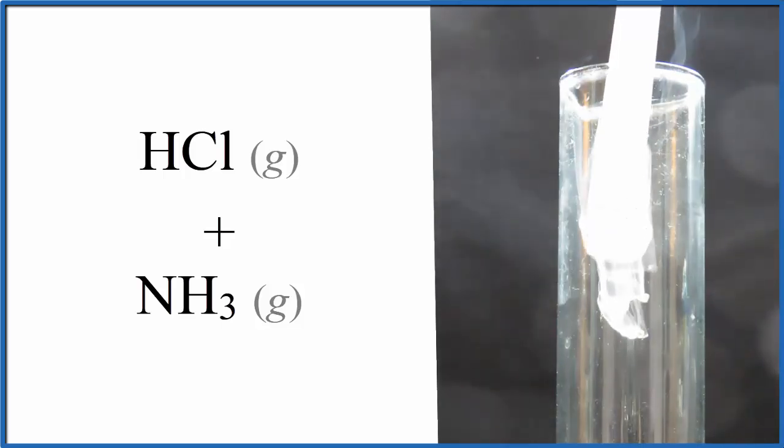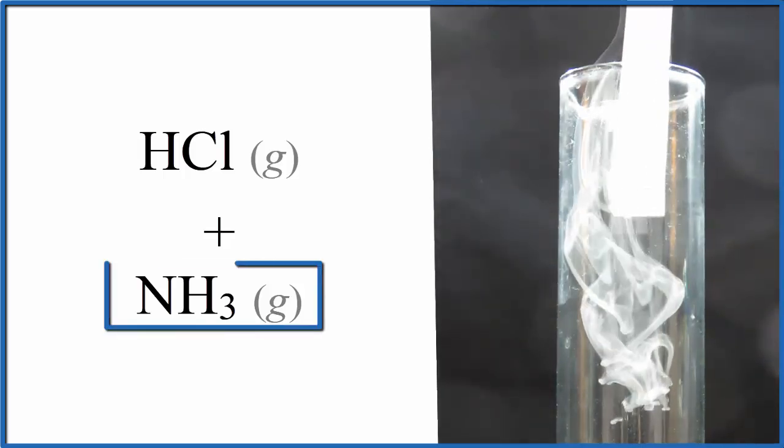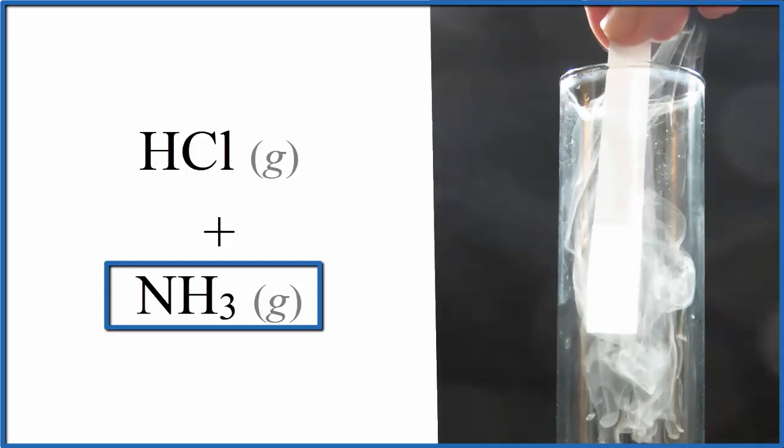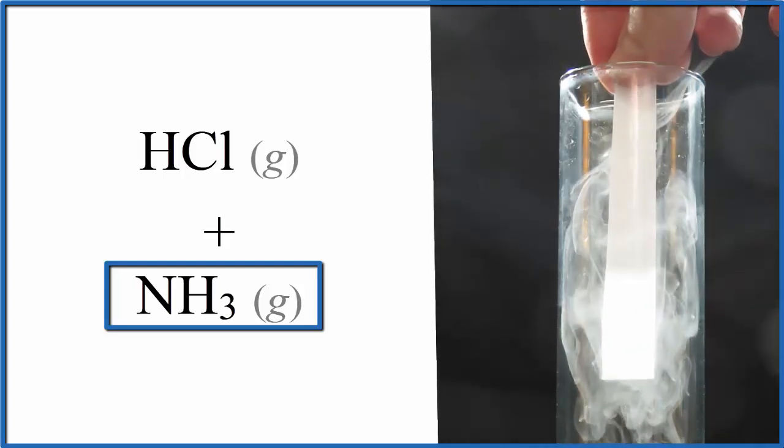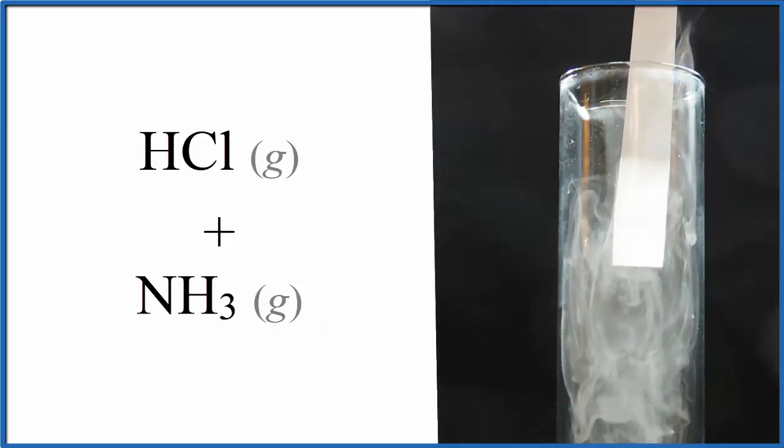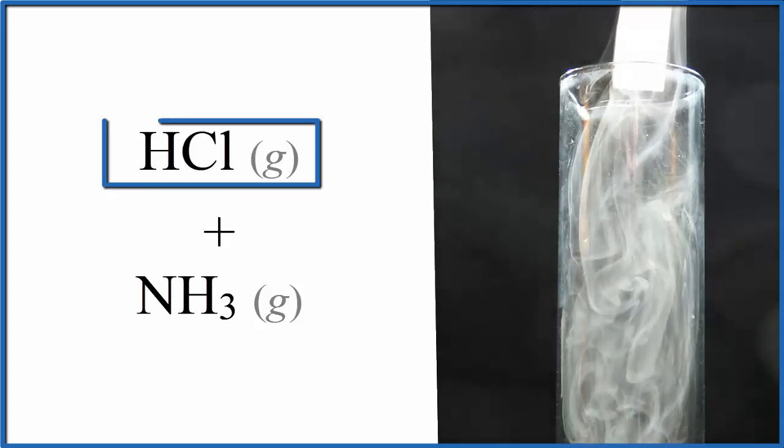So in the glass cylinder, I have ammonia gas, NH3 gas, and the paper, that white paper, I've dipped that in concentrated hydrochloric acid, so the fumes coming off are hydrogen chloride gas.